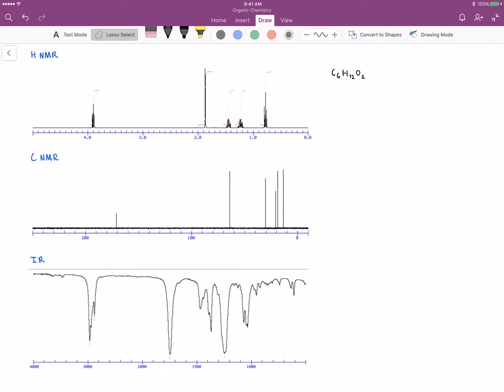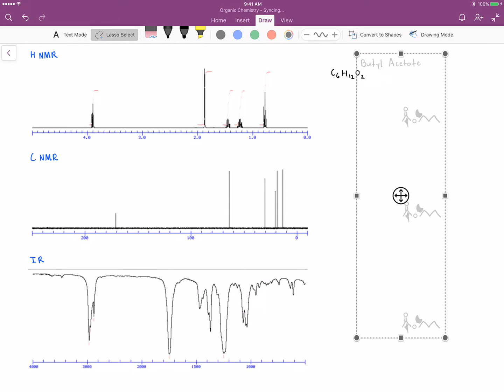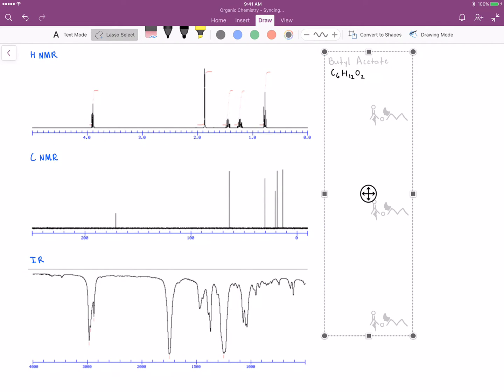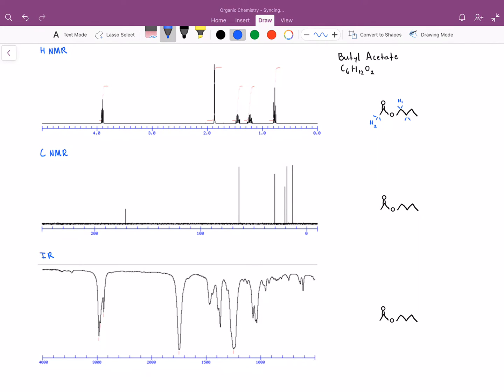Hopefully you had a chance to work through that. The name of this compound is butyl acetate, and there is the structure of butyl acetate provided. Let's go ahead and start with the HNMR. As far as the hydrogens on this compound are concerned, we have two that I'm going to label as H1, three over here that are equivalent labeled as H2, and then these two here as H3, H4, and H5. Those five sets of hydrogens correlate to the five peaks we see on the HNMR.